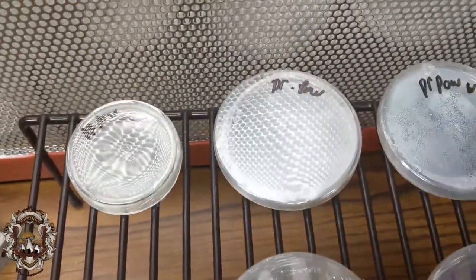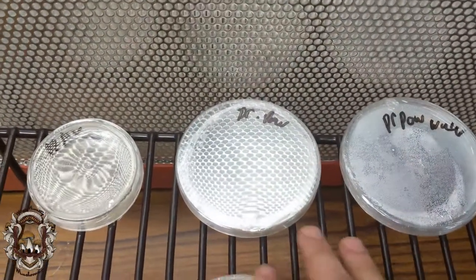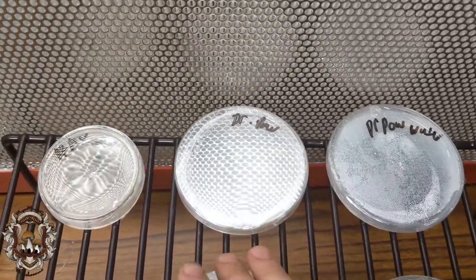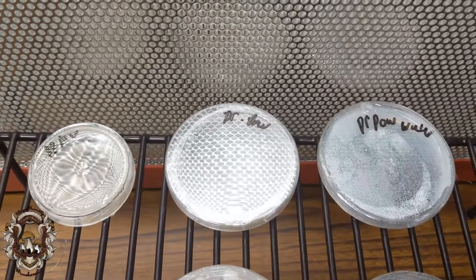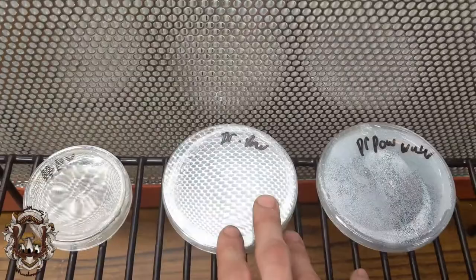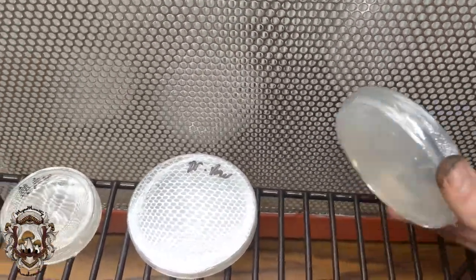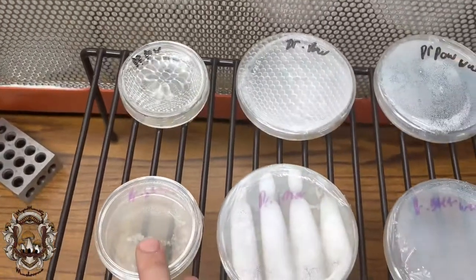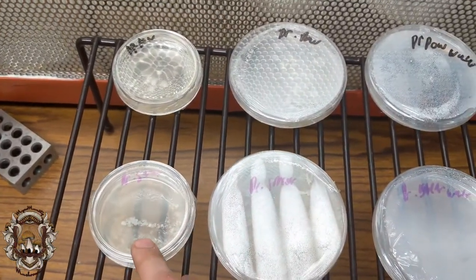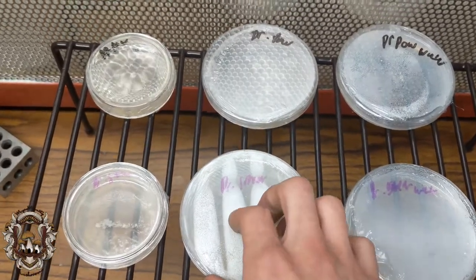So just kind of go off the first video. What we have in these top three is the powder put directly onto the plates. We just have a glass with nutrients, a regular plastic with nutrients, and then this is plastic with just water agar. And then down here, we smeared the solution.